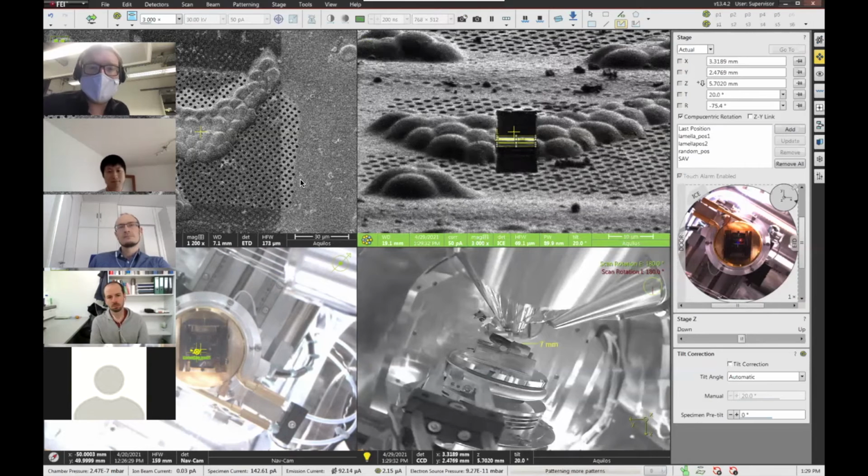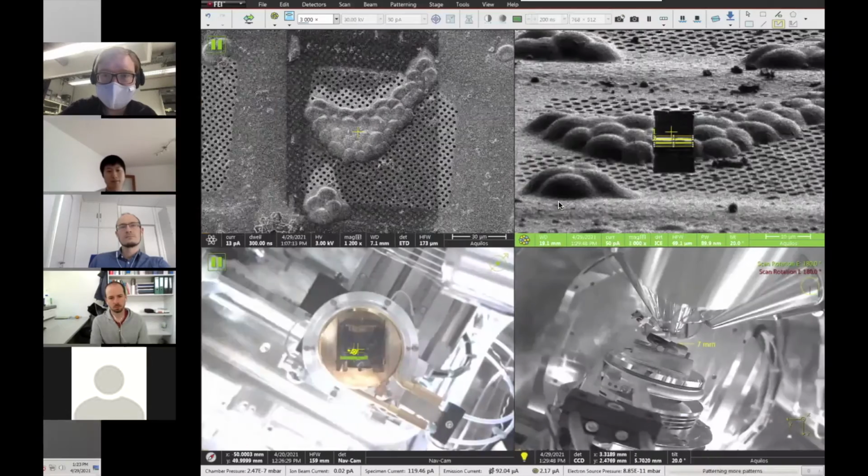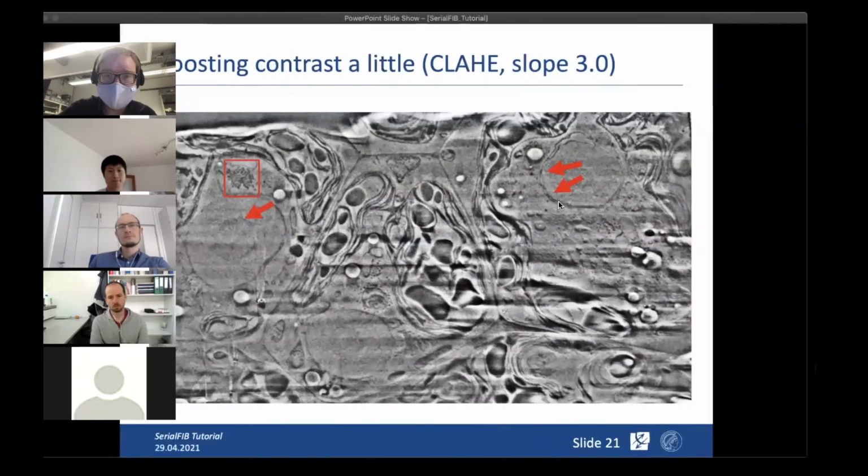And you could obviously do this for several positions, and I can also set that up afterwards if people are interested. Just when doing this live, it's a little easier to demonstrate that way. Cool. Yep.